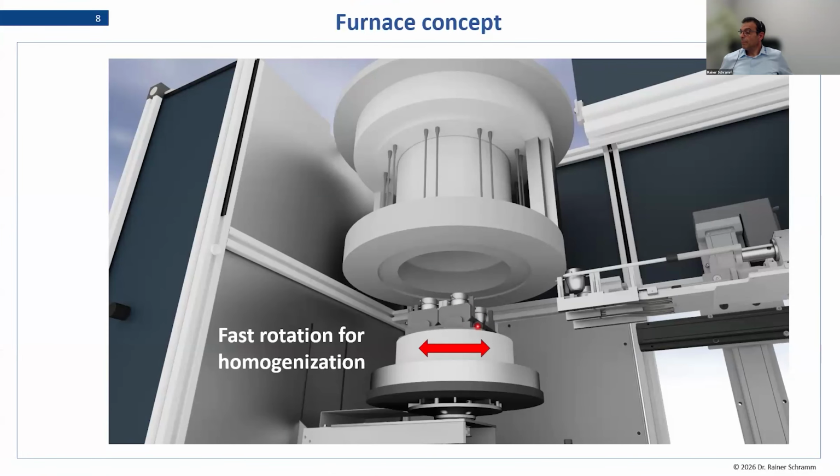So there was a comment here in the questions and answers. There are split opinions about the fusion method. Some suggested that the samples are required to be calcined before fusion, meaning LOI free. Others suggest that there's no need for calcination, just mix the dried sample with the flux, then fuse as usual, which is the universal method and most accurate technique.